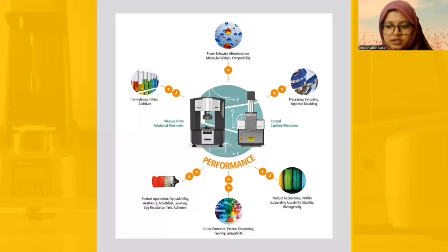We can see here a summarized picture of some of the applications of these two rotational and capillary rheometers in different fields. So as we can see here from the left, some tests are used in different colors.